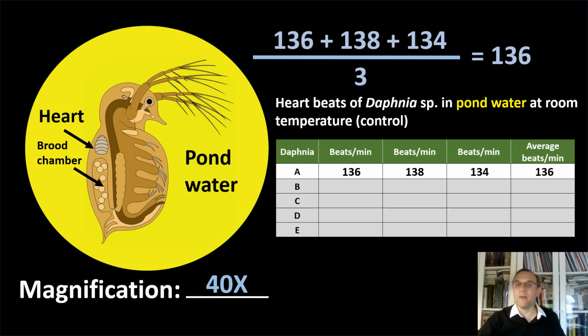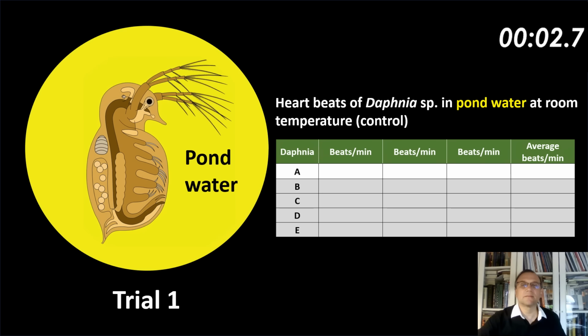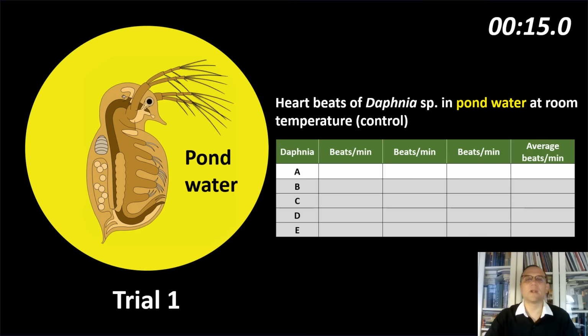While you're looking in the microscope, your peer has to tell you when to start counting and when to stop. For those who work at home, I will be such a peer. Your microscope field is a computer screen. I will tell you when to start counting, putting the dots on the paper, and when to stop. Are you ready now? Get the paper and the pencil or pen. Ready? Start. Stop. Pause this video and record your first number.